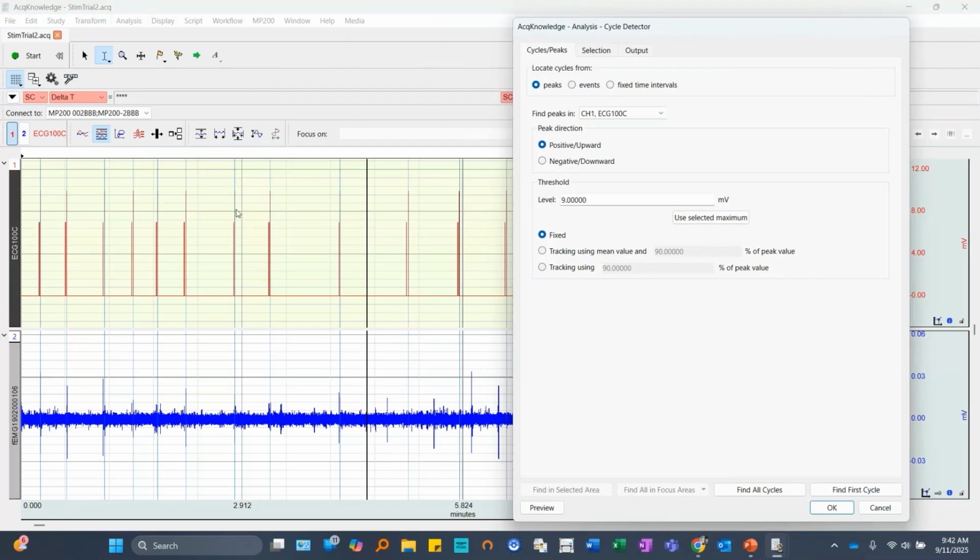And you can see those marked here. Hopefully you can see them. They show up in light blue, right at the peak. This is helpful when we build it out, because we know we're identifying things correctly. When you're in workflow, it doesn't show those visual cues to you. So sometimes it is helpful, I think, to jump out of workflow, create it on the menus itself, and make sure that the settings that you have here are correct.